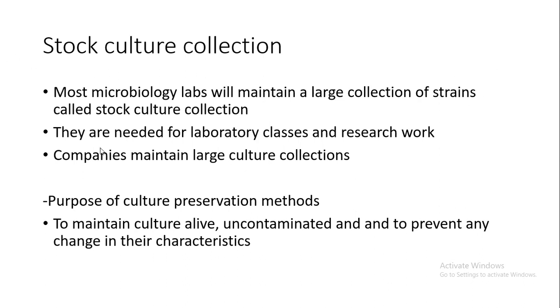Now, once the isolations are done, they have to be maintained in stock culture collections. So, stock culture collections are basically laboratories which maintain large collections of strains, and there are various methods of maintaining these strains.